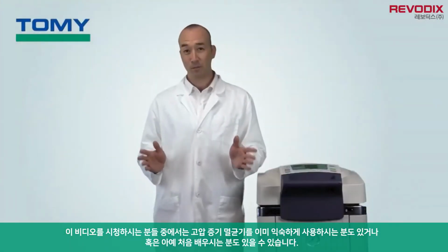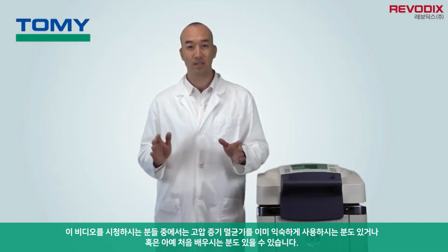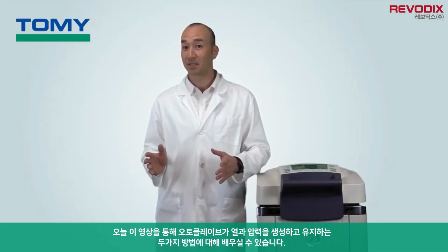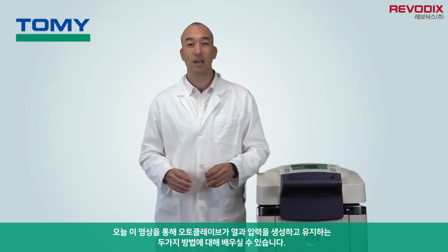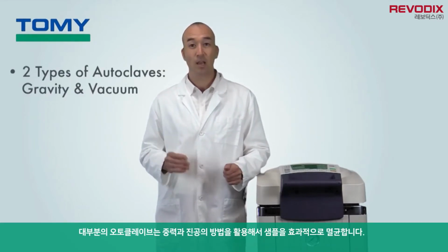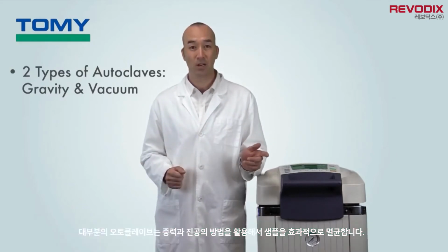As you're probably already familiar, an autoclave, or steam sterilizer, functions through the application of highly pressurized saturated steam. You may also know that autoclaves come in a number of different shapes and sizes, but what you may be learning now for the first time is that there are different ways that autoclaves create and maintain heat and pressure. In this video, I'll be going over two main types of steam sterilization: gravity, or gravity displacement, and vacuum-induced, or pre-vacuum, also known as pre-vac sterilization.